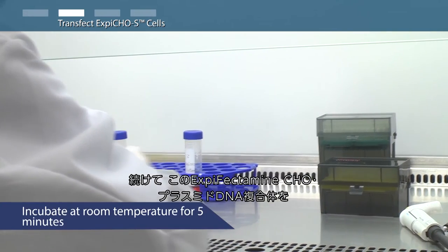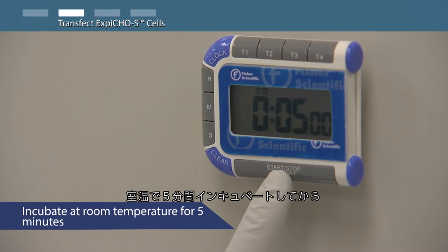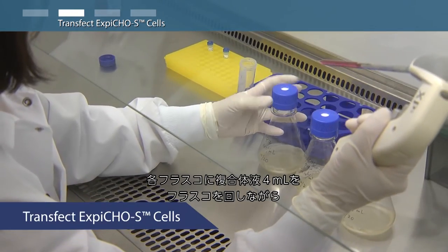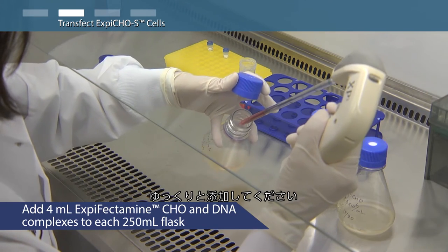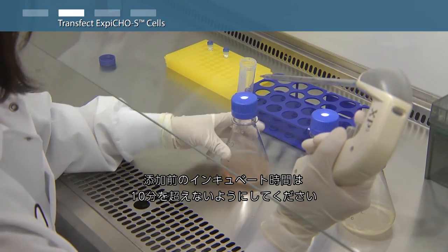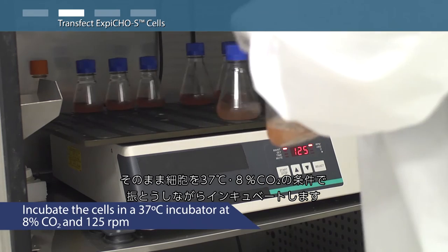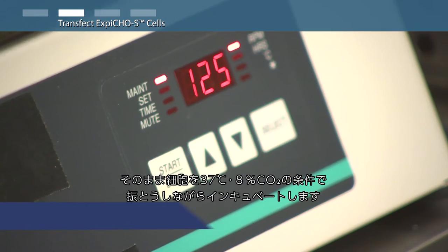Incubate XBCHO and plasmid DNA complexes at room temperature for up to five minutes. Then slowly transfer four milliliters of solution to each of the shaker flasks, swirling the flask gently during addition. Do not allow the complex to incubate for longer than 10 minutes before addition. Incubate the cells at 37 degrees Celsius with 8% carbon dioxide and shaking.